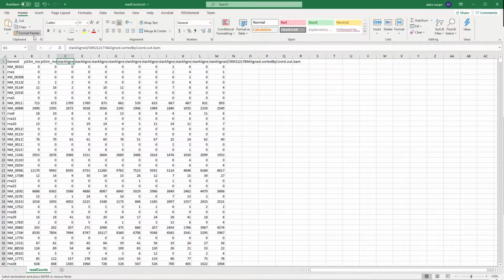Give me a sec here. I have them copied in another one. All right. And then we can go ahead and save this. So now we have our treatments. So this is a treatment, this is a treatment, the next four are a treatment, and then these four are also a treatment. So we have it saved. We can go back over into Firefox.